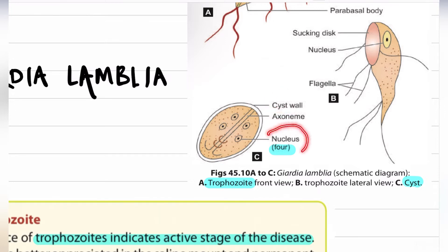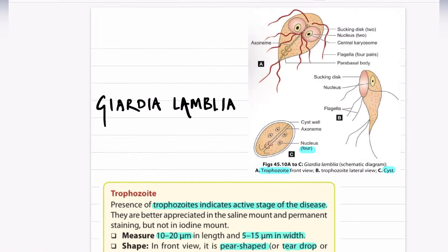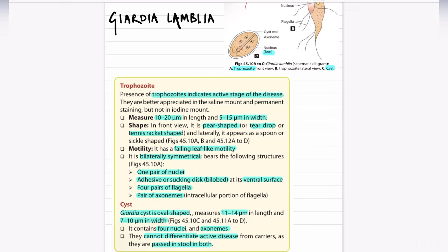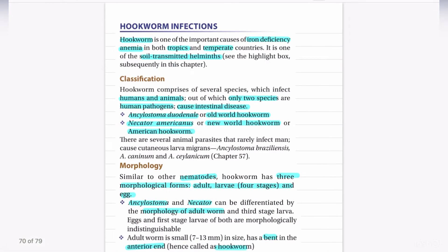The cyst of Giardia lamblia consists of an outer cyst wall, an axoneme, and four nuclei. The size of the trophozoite measures 10 to 20 micrometers in length and 5 to 15 micrometers in width. It is pear-shaped, tear-drop shaped, or tennis racket shaped, and most importantly it has a falling leaf-like motility. The cyst of Giardia is oval shaped, measuring 11 to 14 micrometers in length and 7 to 10 micrometers in width.